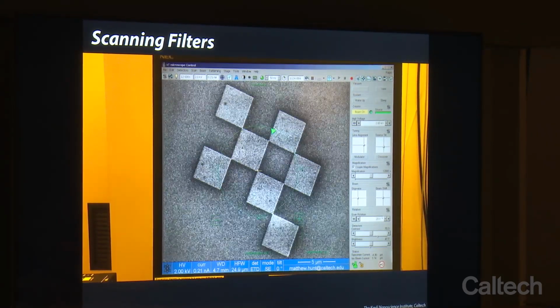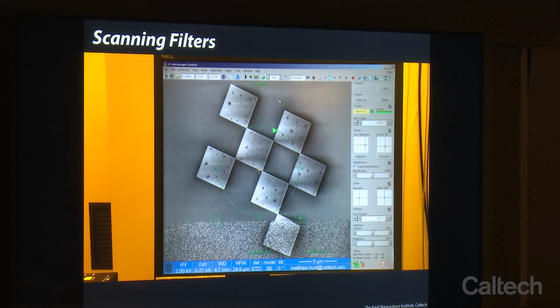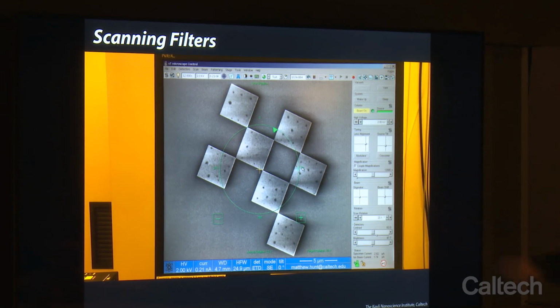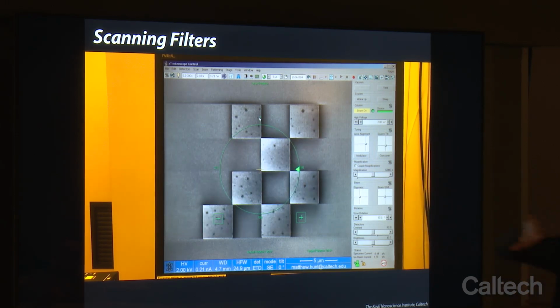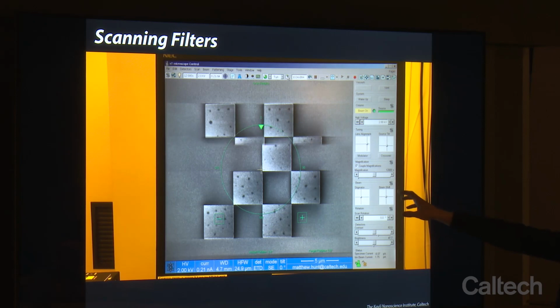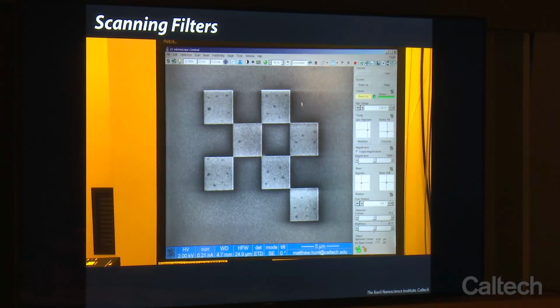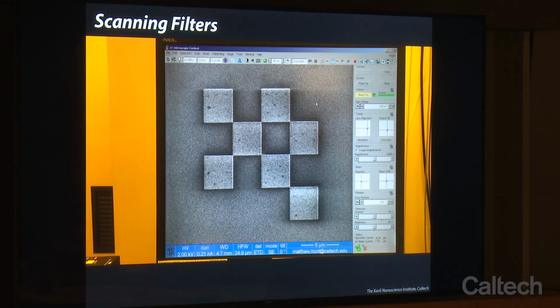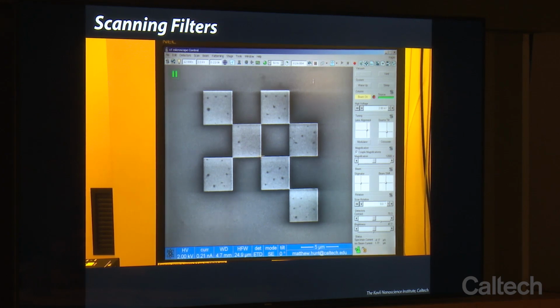Something you could do to test if the artifact is geometric or if it's something real on your system, you can rotate the image. Just rotate the scanning axis of the beam, and sometimes you won't get as many artifacts when you have these squares that are rotated. So that told me this is an artifact, and now I can try to fix it by doing frame averaging. So I'm taking a 50 nanosecond dwell time, averaging it, say, 256 times, and getting a nearly artifact-free image.